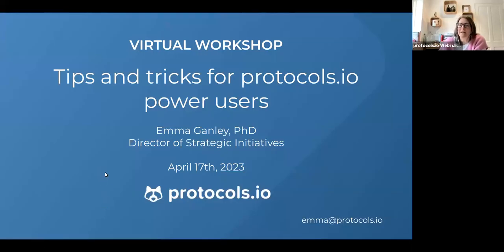Okay, so this webinar assumes that you have already used protocols.io and are a little bit familiar with it, as this shows you a bit more of the functionality in the tool.